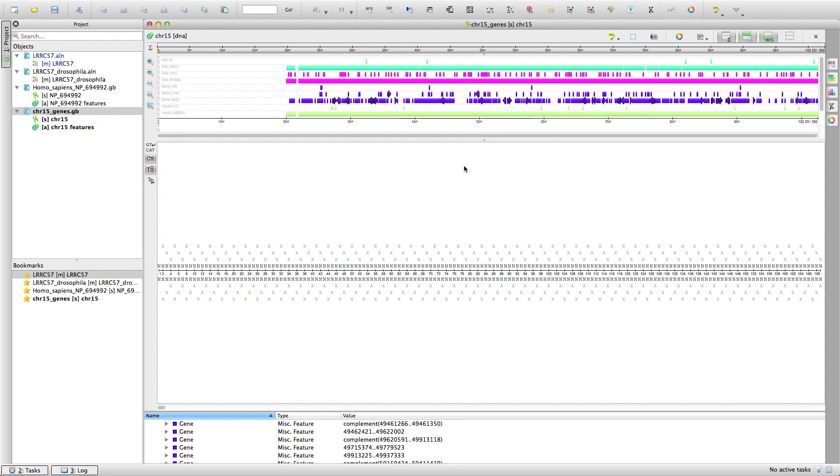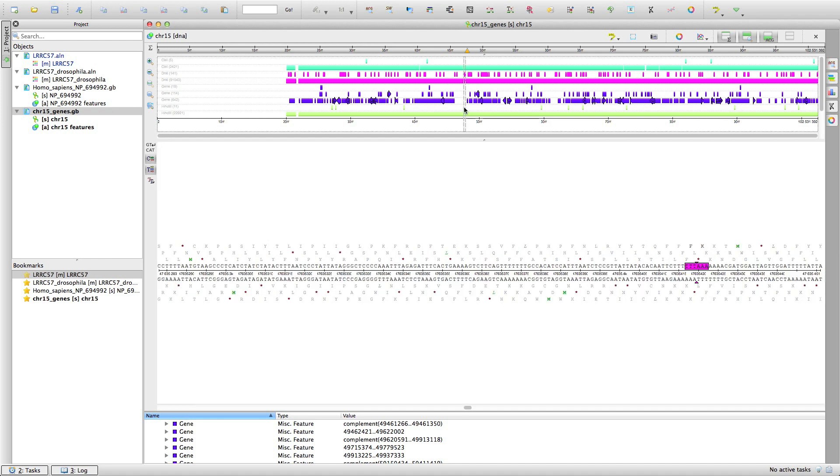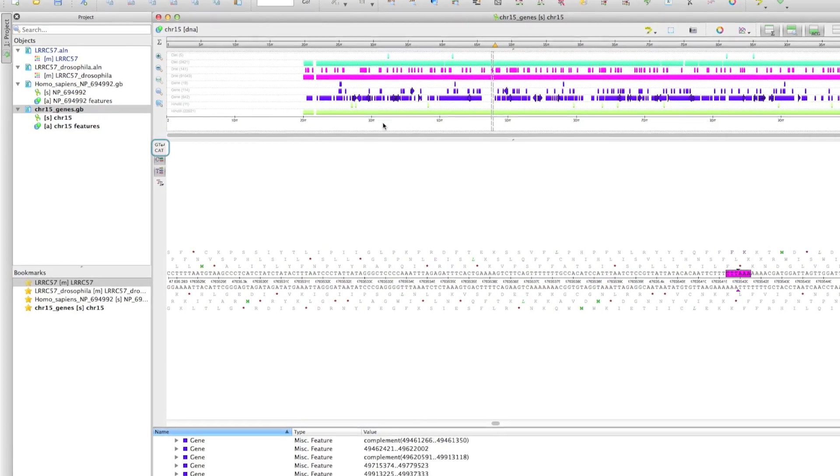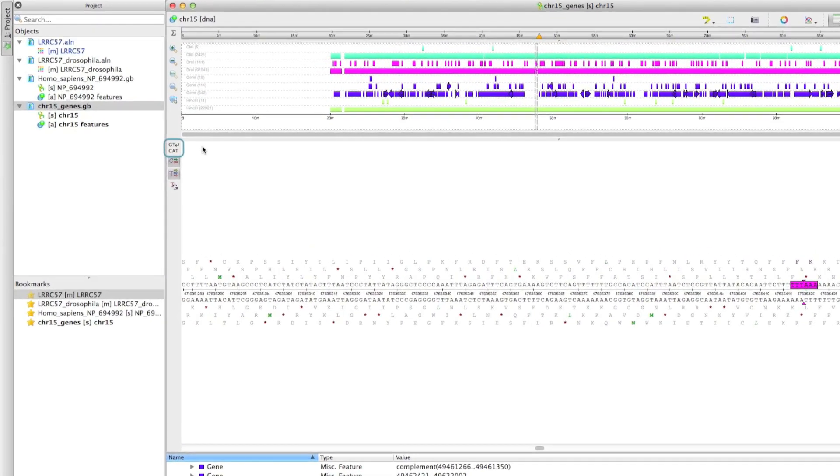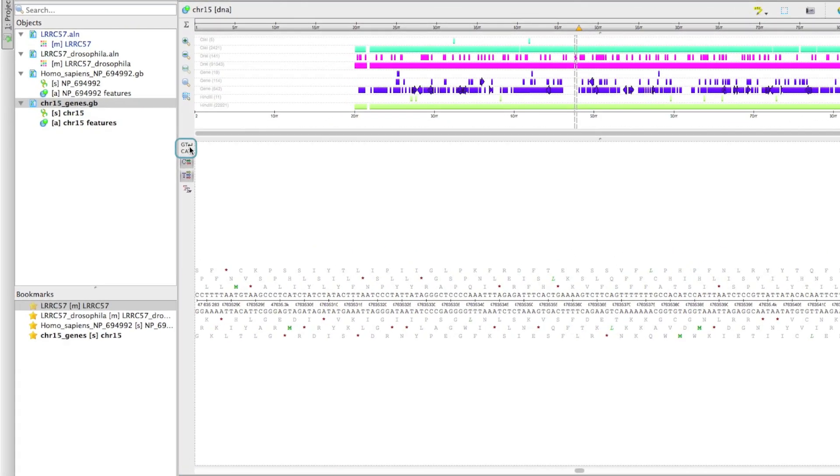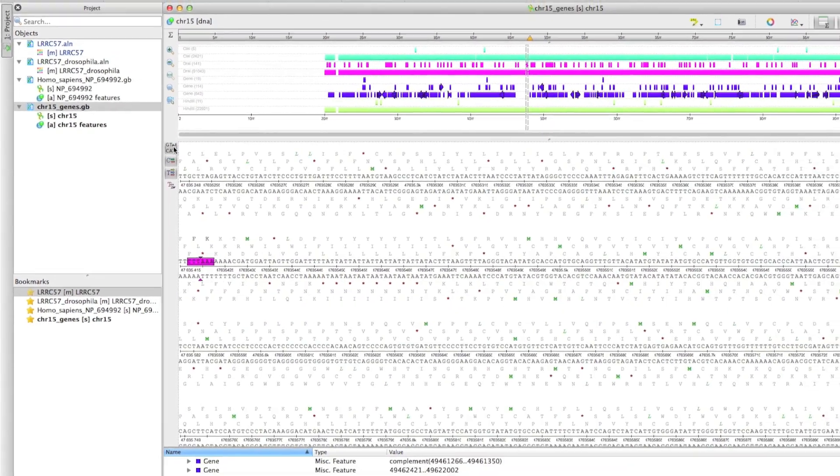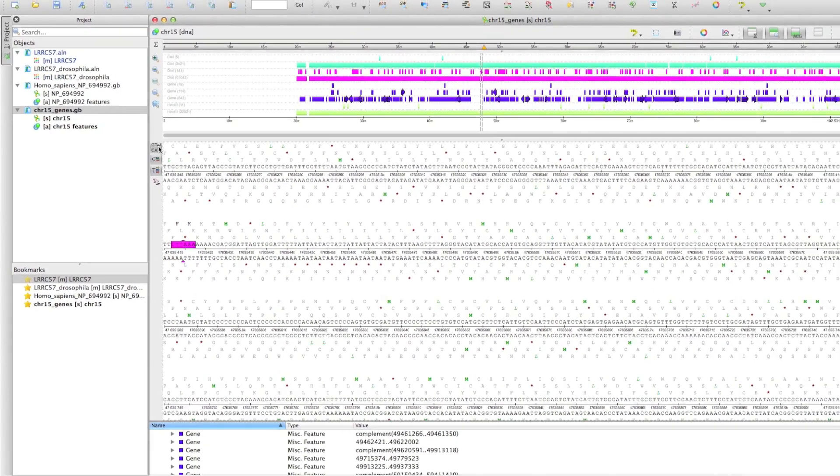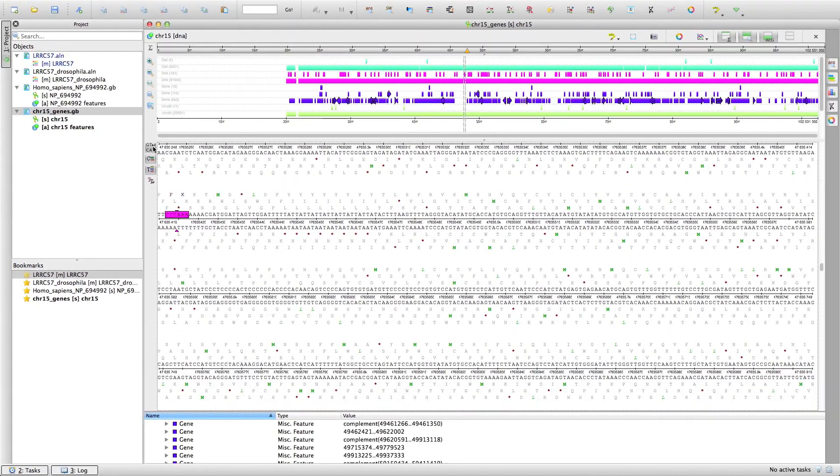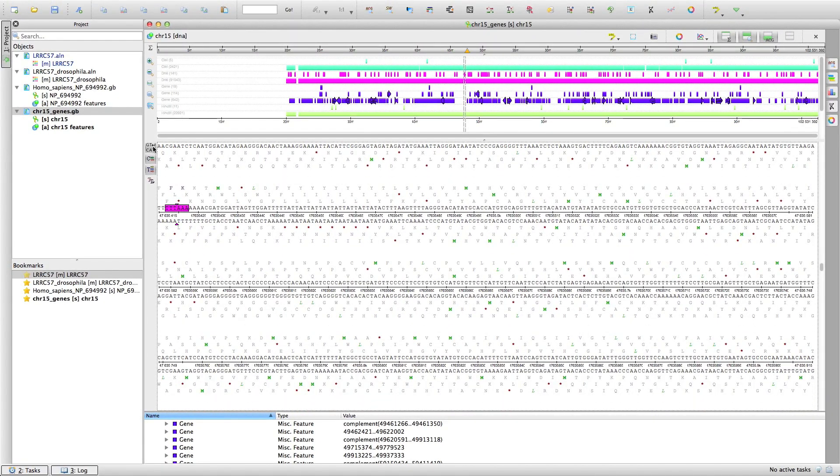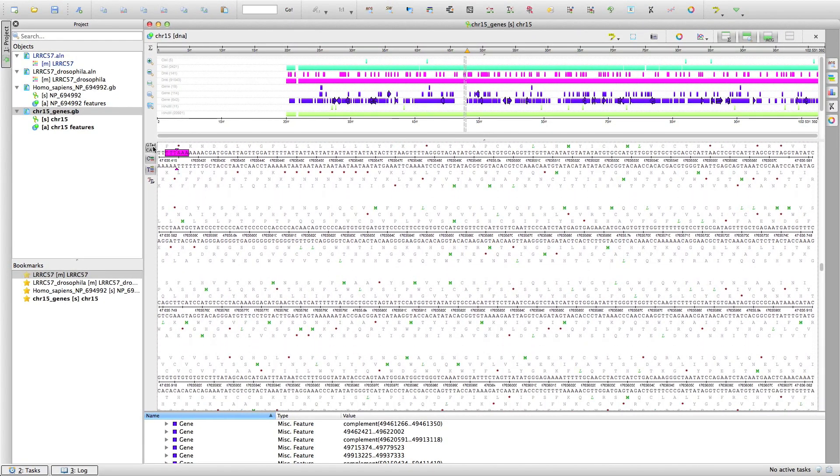Let's look at chromosome 15 of the human genome that contains the LRRC57 gene. There is a new option in the sequence view. You can now wrap the sequence into lines and observe more characters at a time.